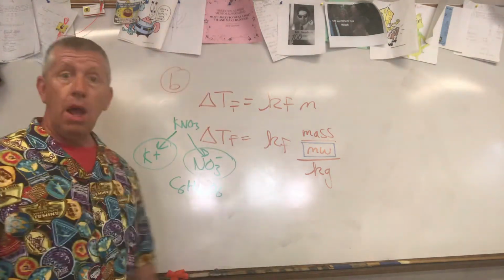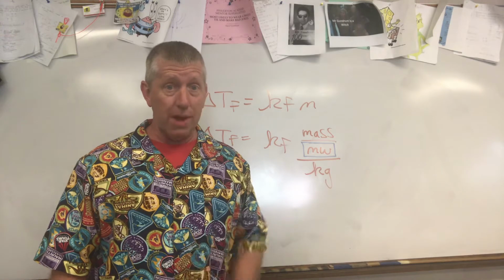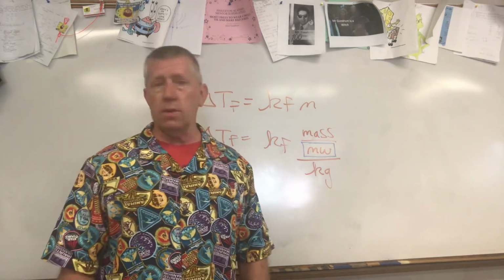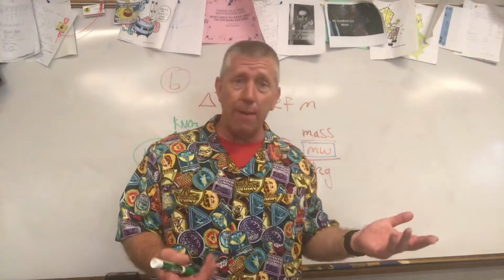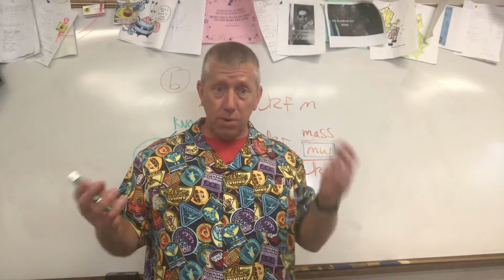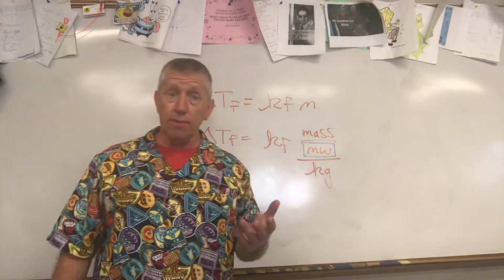What does that mean? Well, if you watch the video on the Van Hoff factor, then you know exactly what I'm talking about now, don't you? Yes, you do. If you don't know what I'm talking about, then you need to go watch that video. This has twice the effect, which makes sense if you think about the freezing point depression for the two. The freezing point depression for the potassium nitrate was much lower. Okay, it was much more effective. It was negative 3 point something as opposed to the sugar, which is only like negative 1.3.